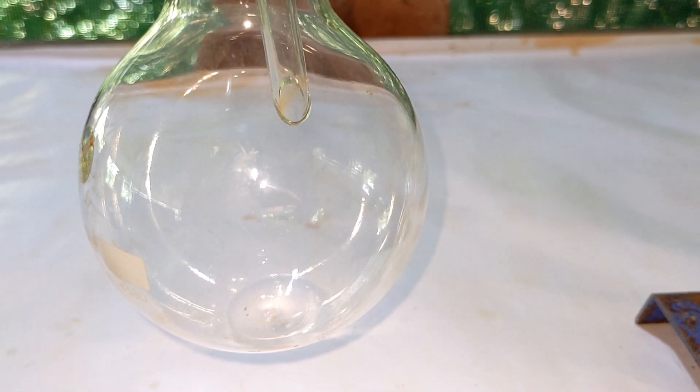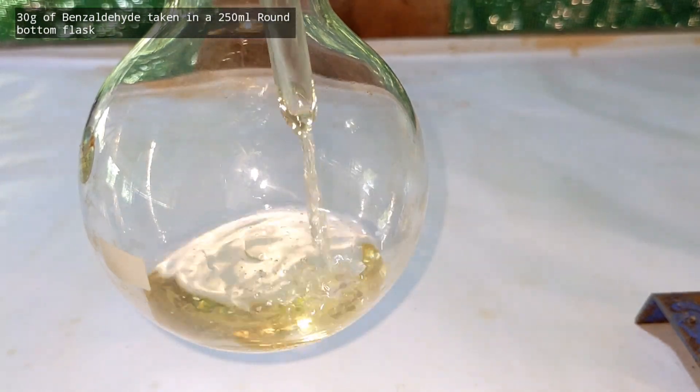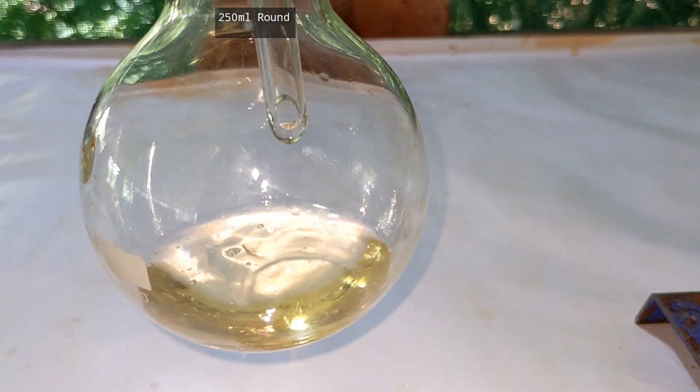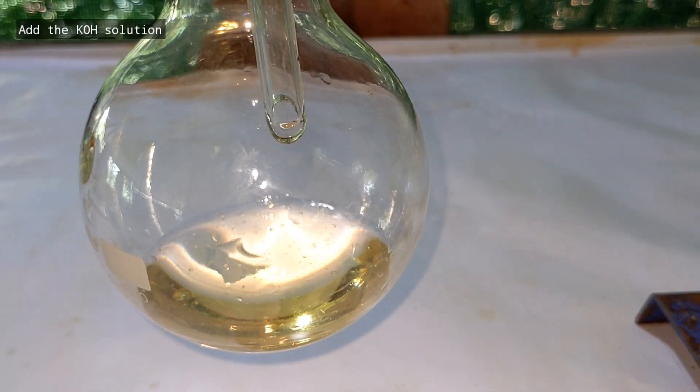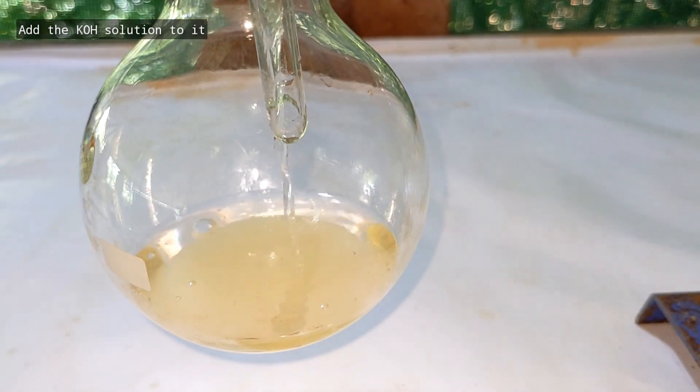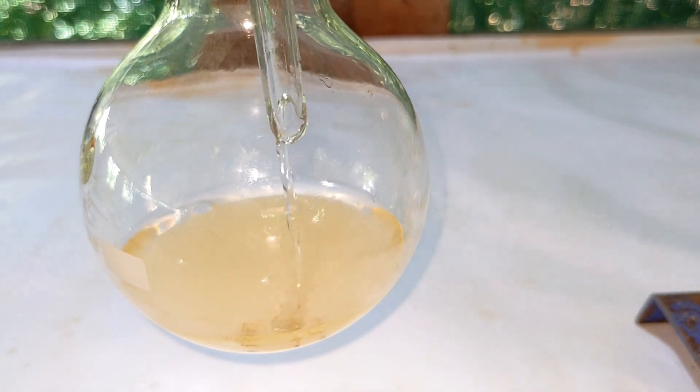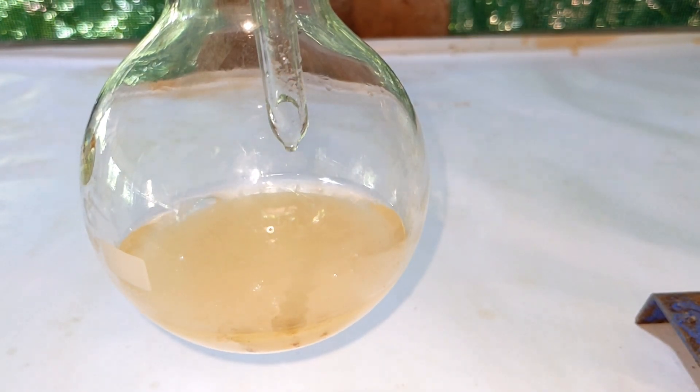Now a 250 ml round bottom flask was clamped on a stand and into it was added 30 grams of freshly distilled benzaldehyde. Then the highly concentrated potassium hydroxide solution was added to it. After adding the potassium hydroxide, the flask was shaken vigorously to make a uniform suspension inside the flask.